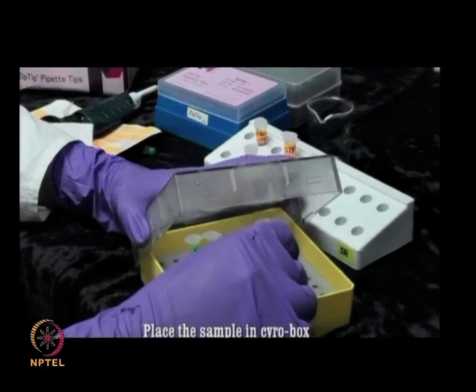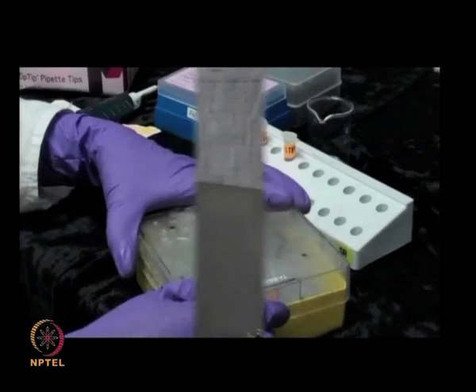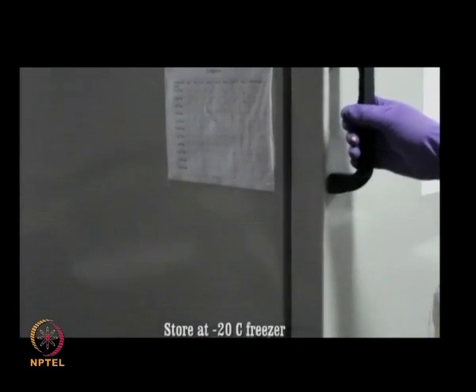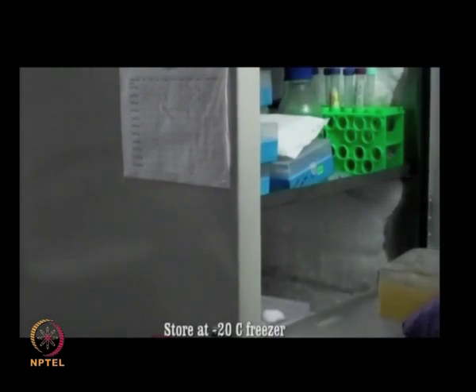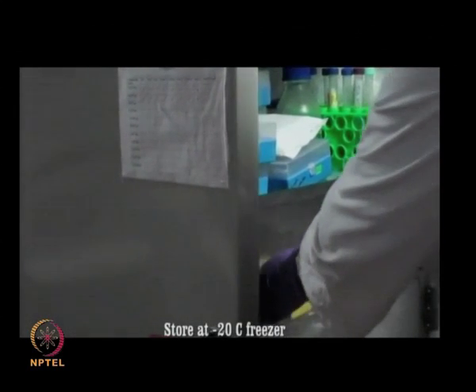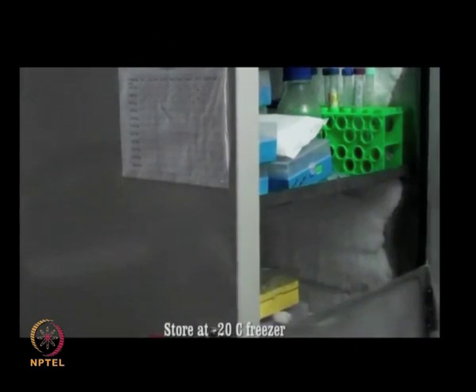After the elution is done, you can keep these processed samples in cryo boxes and store them in minus 20 degree centigrade freezers. The in-gel digested samples which have been processed using ZipTip can be further analyzed by mass spectrometry.